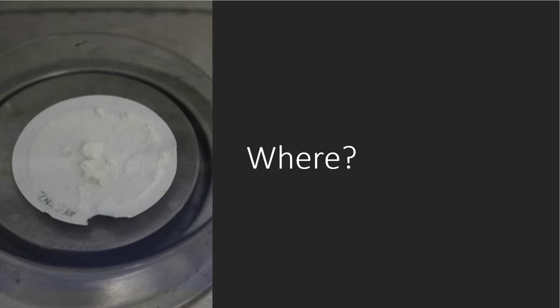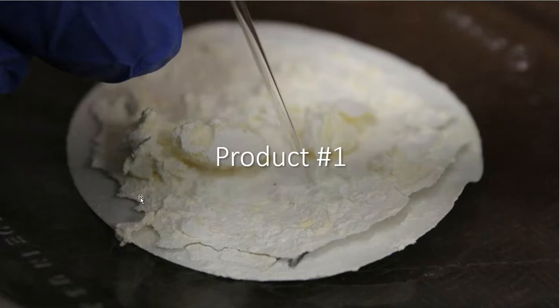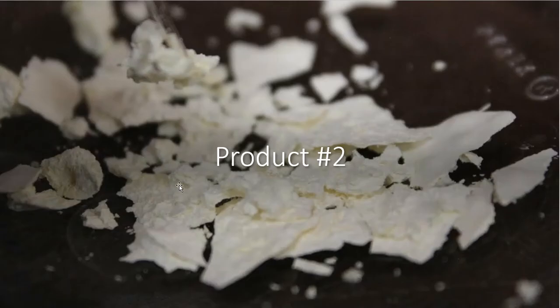All right, so my job's not yet done. Almost, though, but not yet. I need to do a melting point. So I'll go get my capillaries for the melting point apparatus that we have. And I go back to product number 1, which is here. Look, it just kind of crusted up into one big lumpy mass, right? So I'm going to take this capillary and just cram it down onto the inside of it. And then I'm going to do the same thing for product number 2.